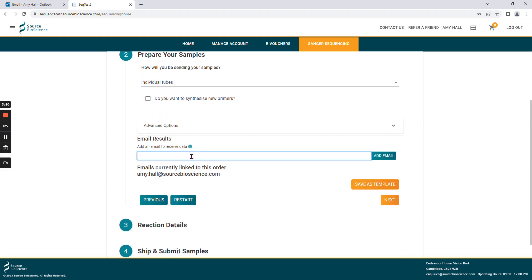You can also choose to add email addresses to your order by typing the email address in this box and selecting add.